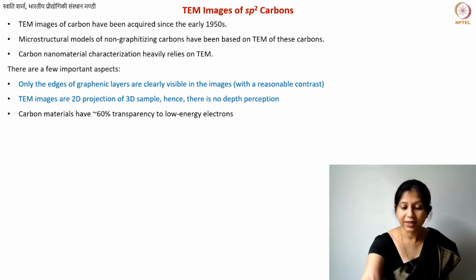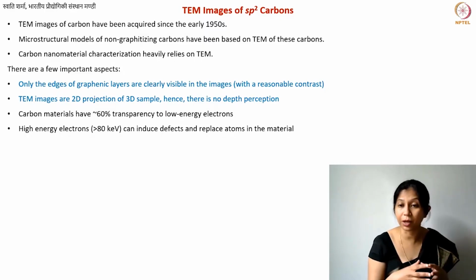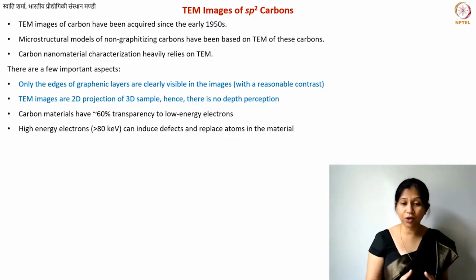Okay, fine. As I said, carbon materials are transparent to X-rays and various other wavelengths, but also for electron wavelengths they have a reasonably high transparency, especially for low energy electrons. But we need to use low energy electrons, because high energy electrons damage your sample. Most of the TEM equipment that is available often operates at 300 kilovolts, but you can go down to 100, though it's really difficult. In fact, a lot of instruments do not allow you to go below 100 kilo electron volts. And the optimum voltage is below 80 kilovolt.